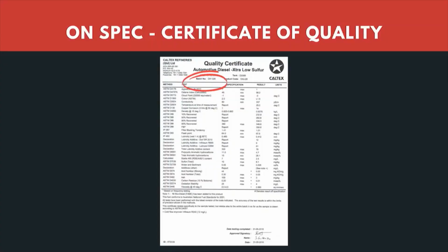So, in order to avoid that, more and more online analyzers are being employed in a refinery. Of course, online analyzers are quite costly, and to maintain them we need trained and skilled manpower from the instrument maintenance department.